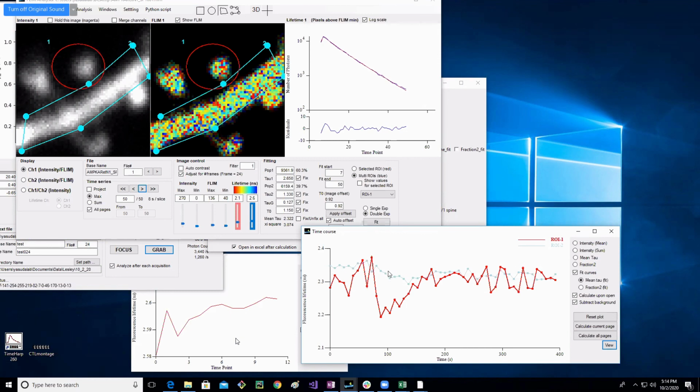You can see when I have more photons in the dendrite, in this blue curve here, it's much less noisy, right? It's not bouncing up and down as much, and that's because I have more photons that I'm averaging in. So what can make a drifty baseline? It could be just that your neuron's not settled. When you put it in ACSF, it needs time to settle. It could also be photobleaching, something like that. So it's important that you have a nice flat baseline.